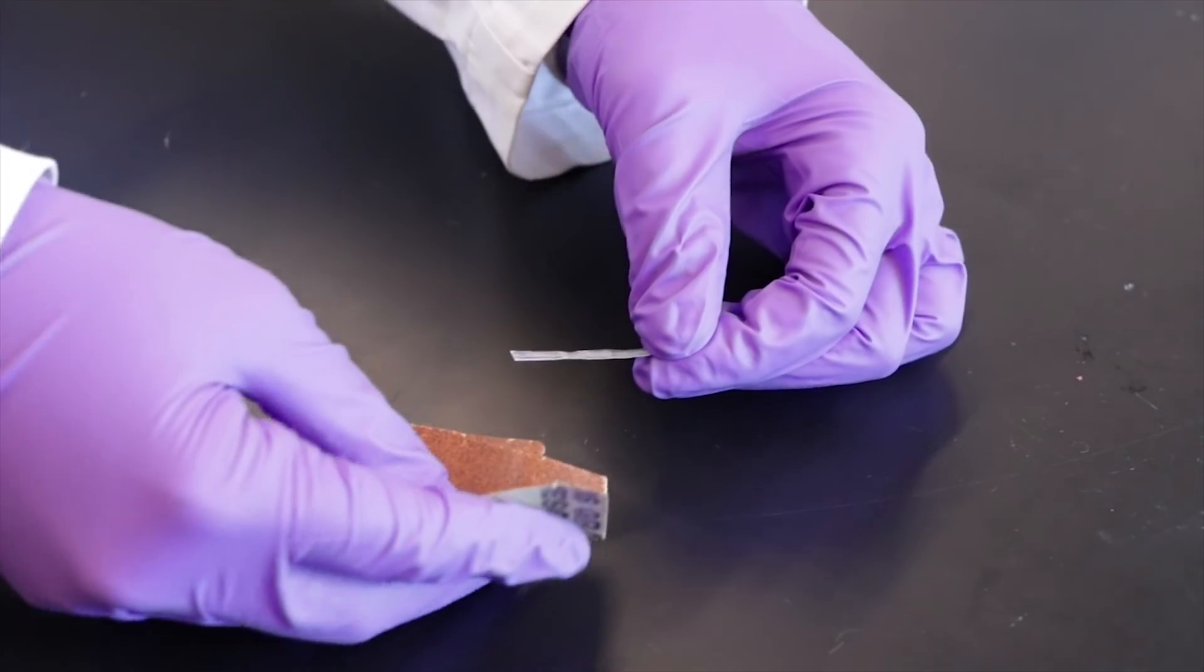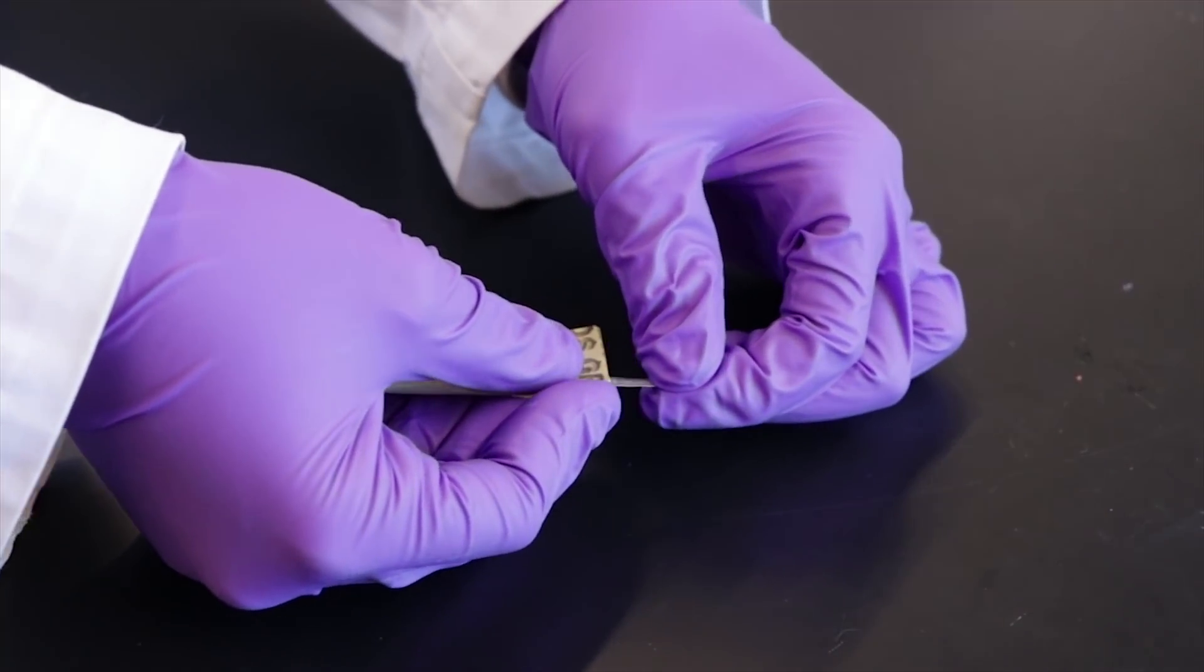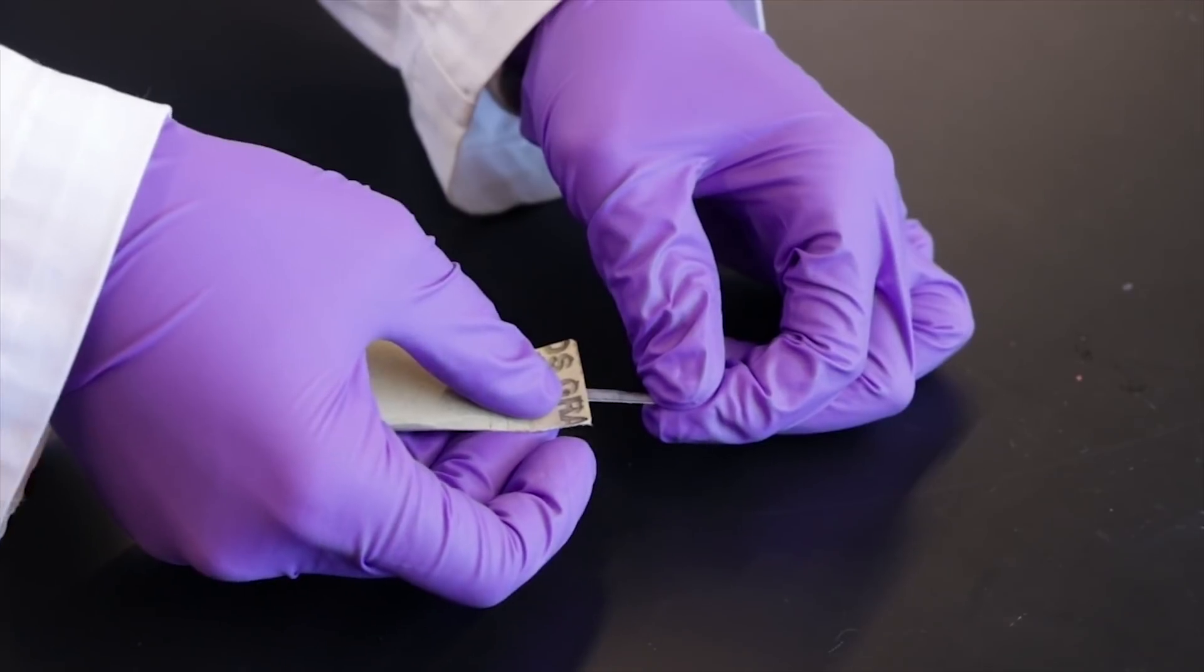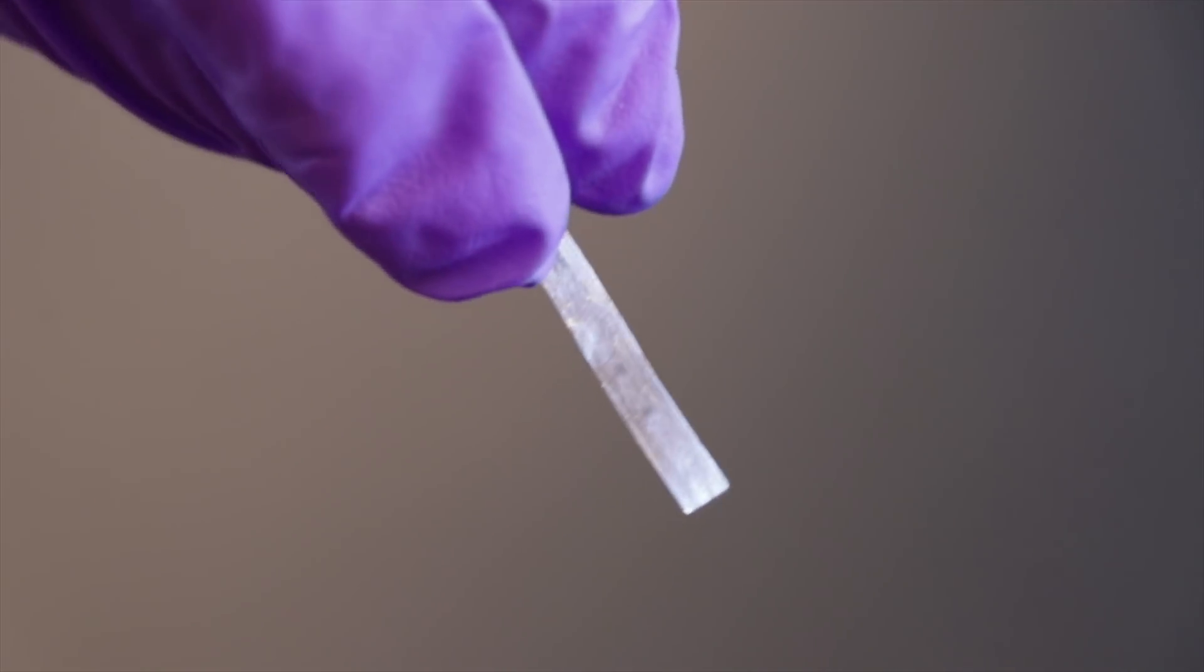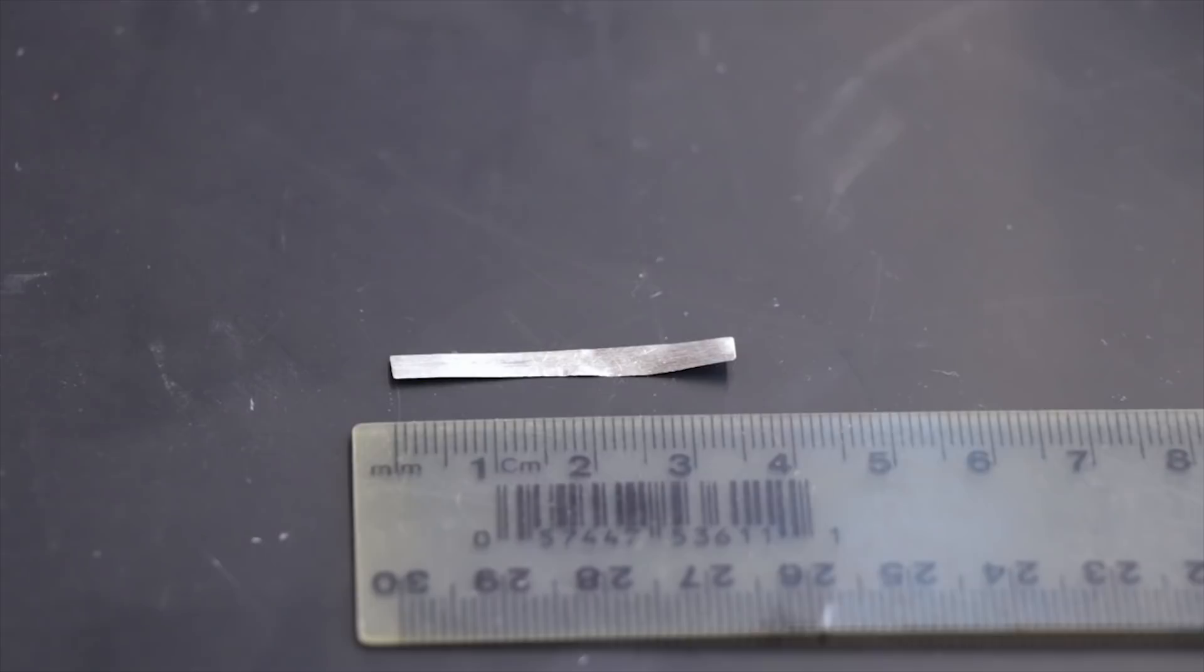For this experiment you will need to cut out a piece of magnesium ribbon of the appropriate length as determined by your pre-lab calculations. Sand the ribbon gently to get rid of the oxidized layer. Once all the outer coating is sanded off, cut the ribbon to the desired length.